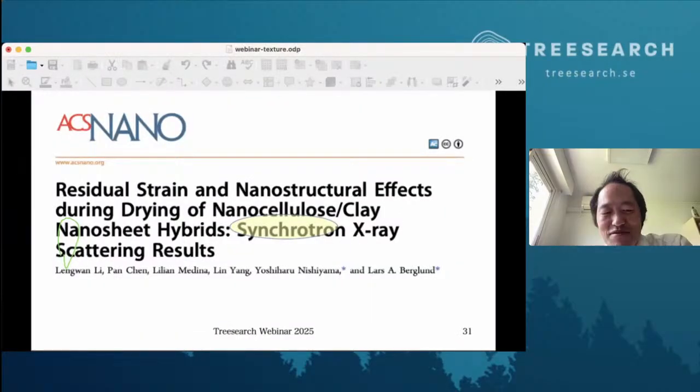Nowadays, you have a lot of availability of synchrotrons. You have MAX IV in Lund in Sweden. Then you want to have something that justifies the use of high brilliance X-ray. And this was one example like this. The way we analyze it at the end is always the same.